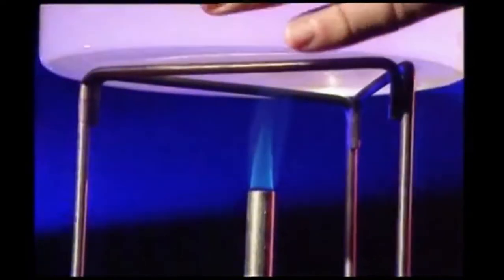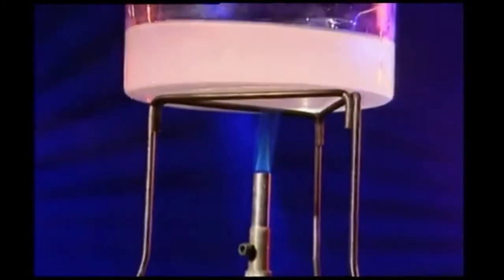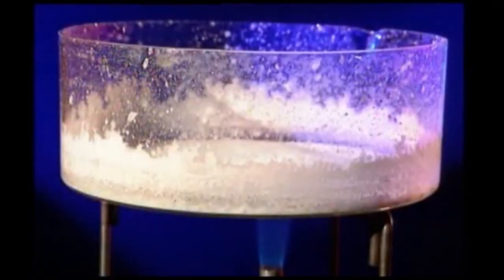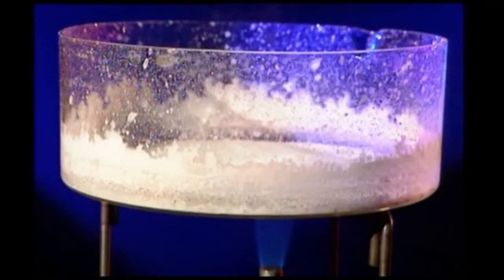There are ways of getting the salt out of the solution. If the solution is left, the water will eventually evaporate, but the process can be speeded up by heating it until the water boils. As the water vapor rises, it disappears. Eventually, all the water is boiled away until only the salt remains.